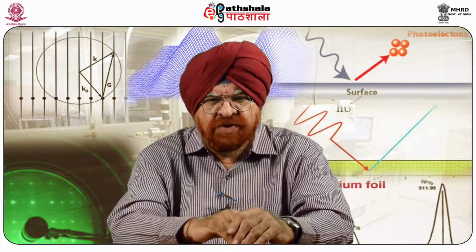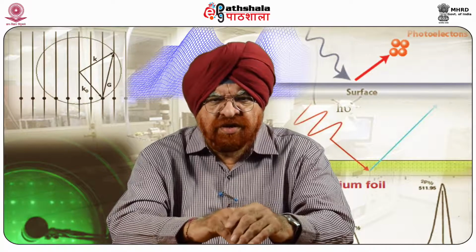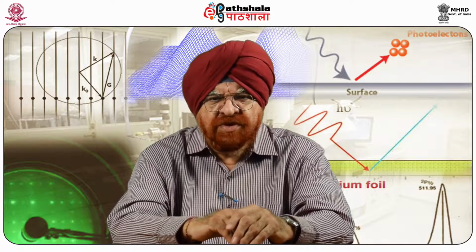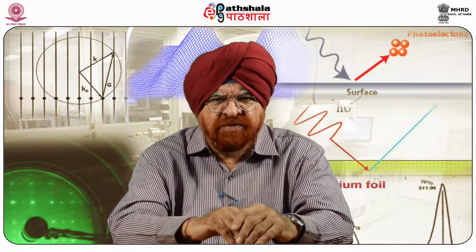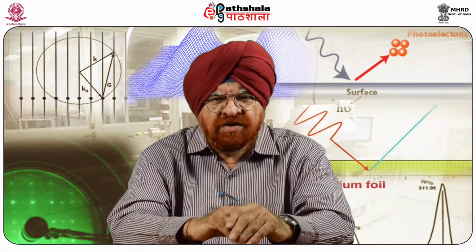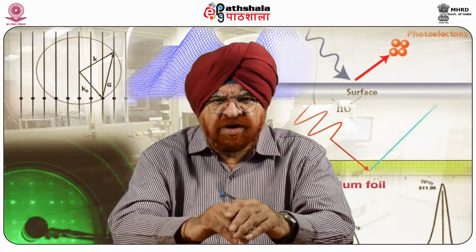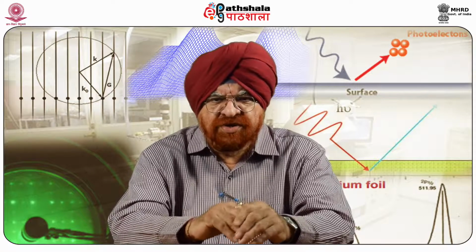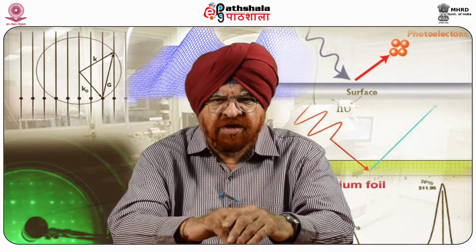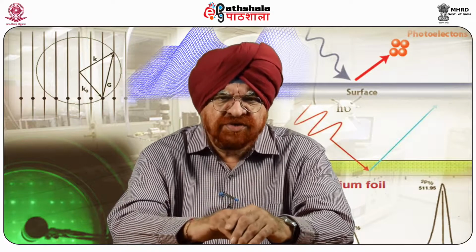In magnetic force microscopy, when we start measuring, it involves the magnetic force between the sample and the tip, and it can be expressed by a mathematical relation which has been given below. Here, M is the magnetic moment of the tip, approximated as a point dipole. H is the magnetic stray field from the sample surface, and mu0 is the magnetic permeability of free space.